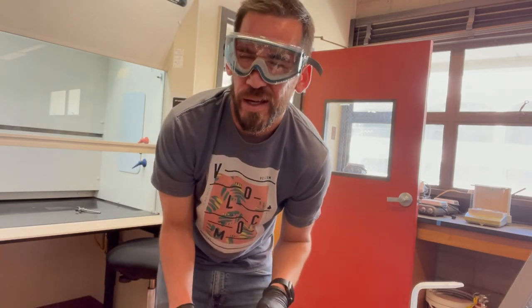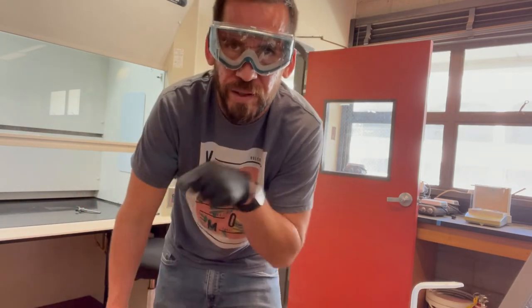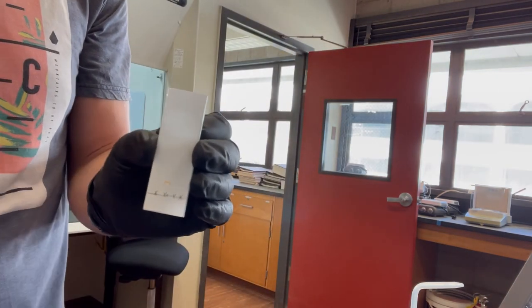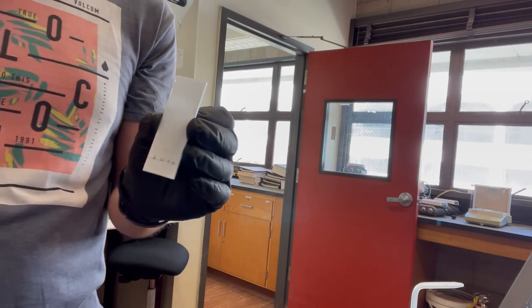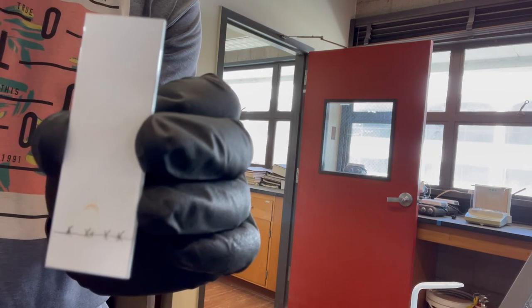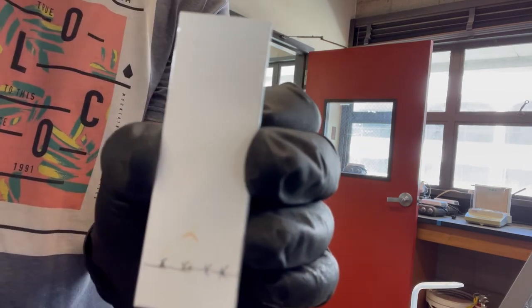So, of course, while that TLC is running, what we want to do is set up our boiling point. All right, so I did get my boiling point tube set up, but I also had to stop this. So let's do a long wave first. How did I do this before?